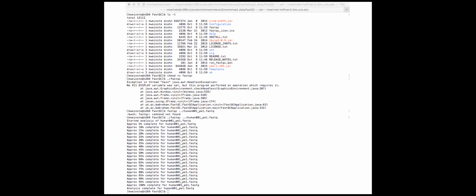Okay, cool. Once this is done, do a Google search to try and find CyberDuck. Everybody should go and download a copy of CyberDuck.